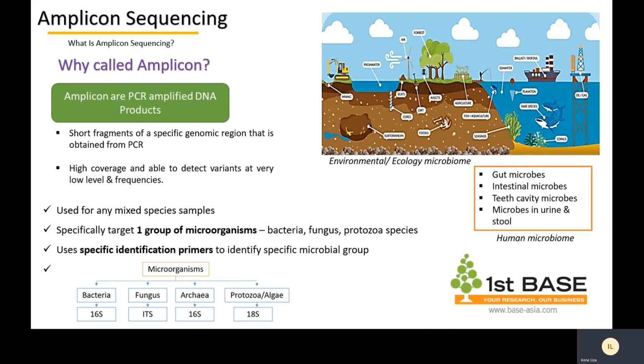What we are seeing here at the bottom are the microorganisms, like what I explained earlier: bacteria, fungus, archaea, as well as protozoa. These are the microorganisms, and these regions are not primers, they are identification regions to identify these particular species.